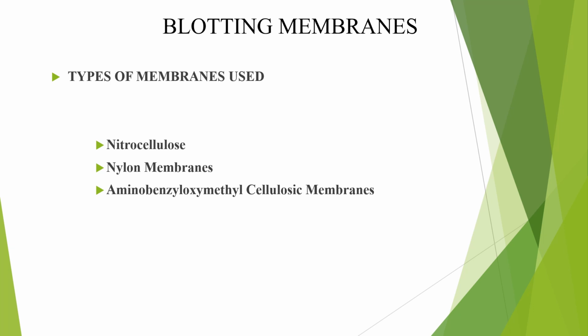For the membranes used in blotting technique, three types of membrane are used. First is nitrocellulose, then nylon membrane, and aminobenzyl oxymethyl cellulose membranes. These are all the membranes used for blotting techniques.